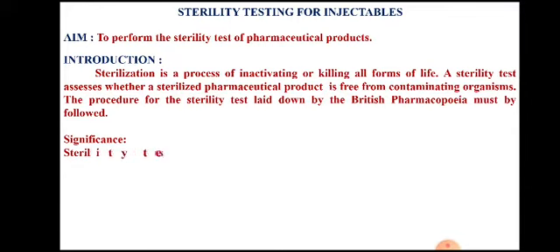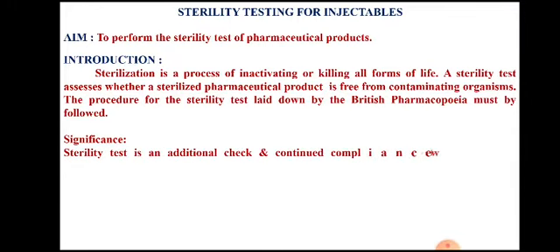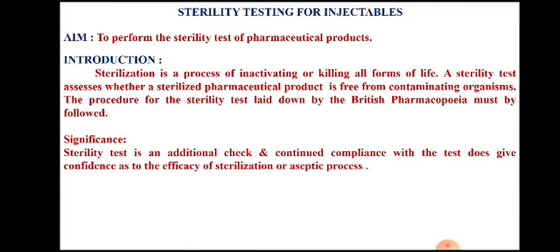The significance of performing this sterility test is very clear. It is the additional check, and continued compliance with the test does give confidence in the efficacy of the sterilization or aseptic process.